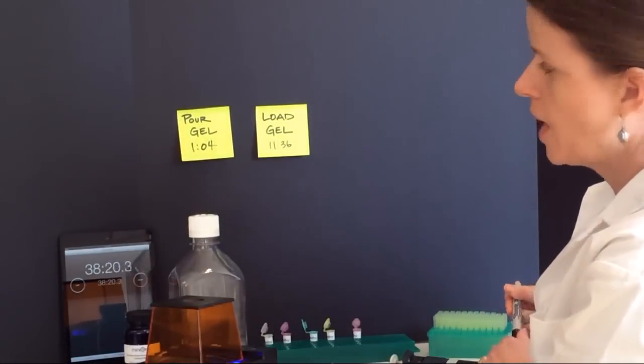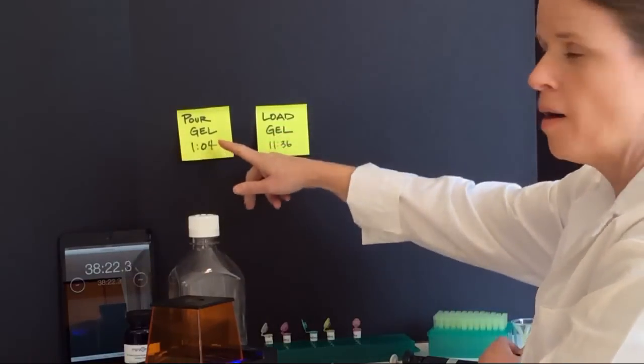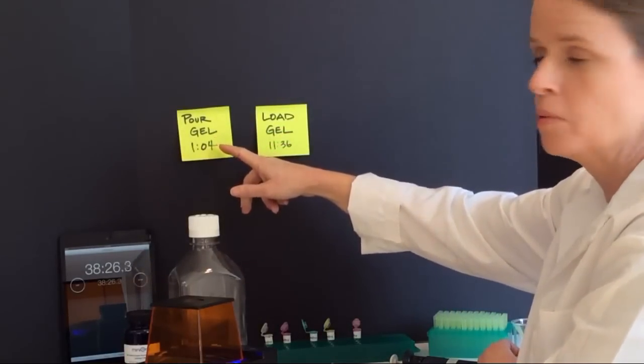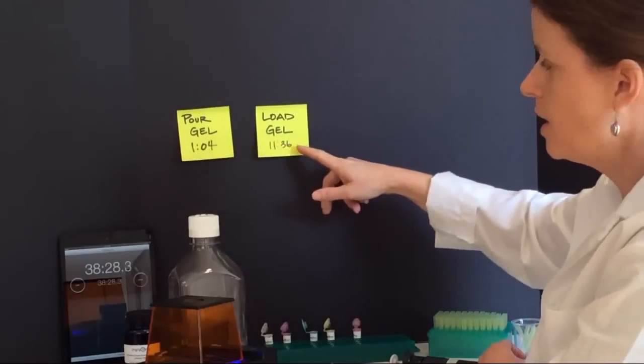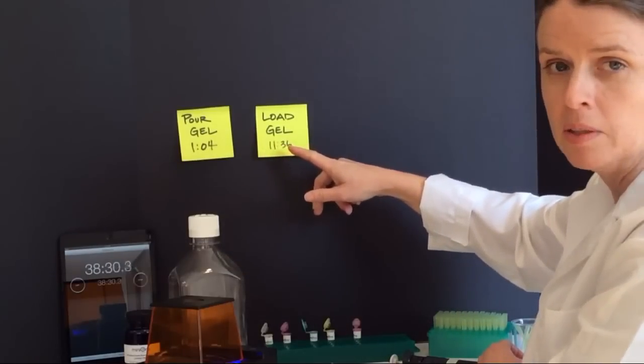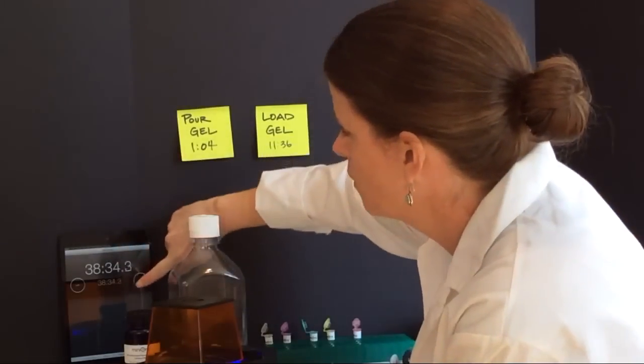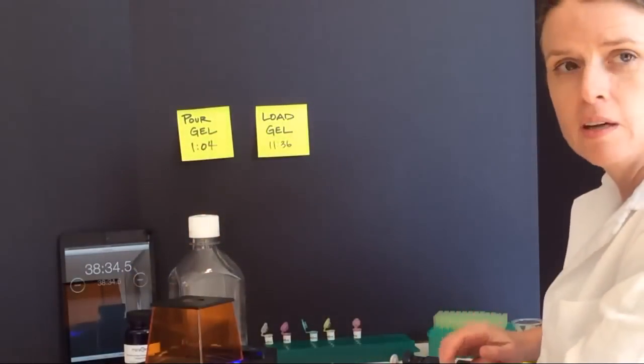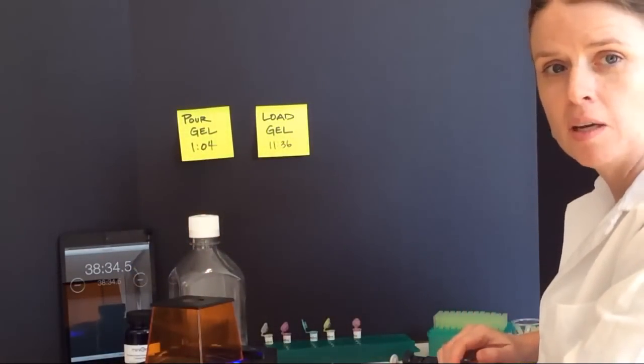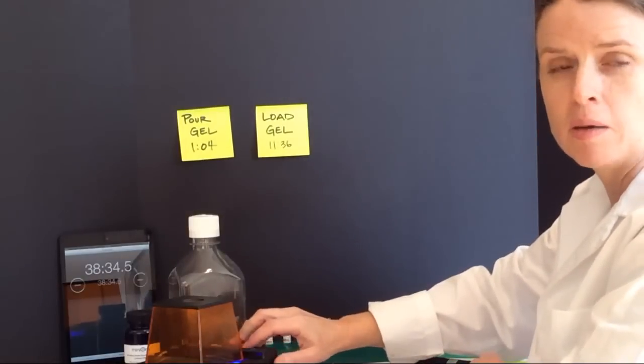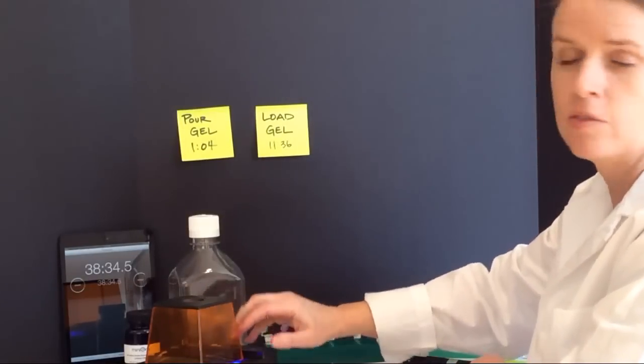To recap our time, about one minute after we started our experiment, we were able to pour our gel. And just 11 minutes later, we were able to finish loading. And here at 38 minutes, we've completed our gel. We've actually documented it multiple times and been able to look at our data to analyze it in less than 40 minutes.